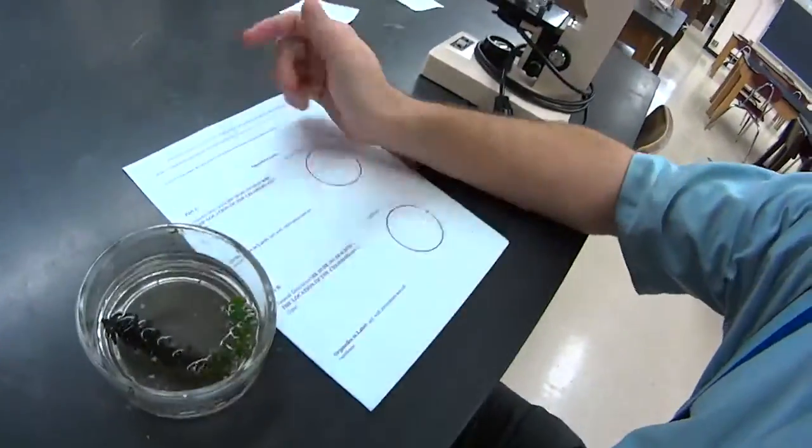Alright guys, we're going to do a little lab today. Should be fun. You're going to be doing the lab today with this elodea, which are these plants in this dish. It's an aquarium plant — they're kind of cool.